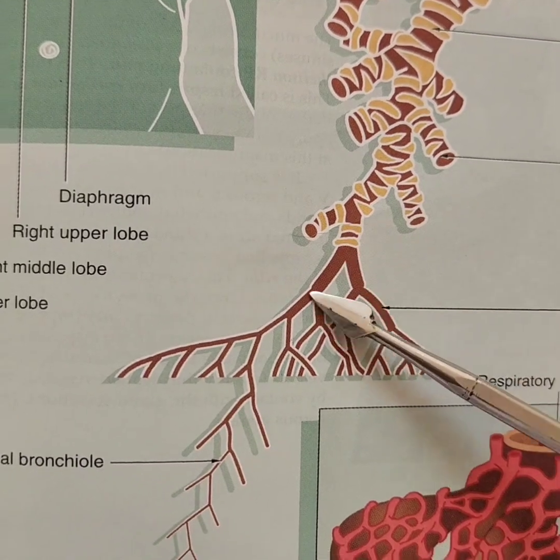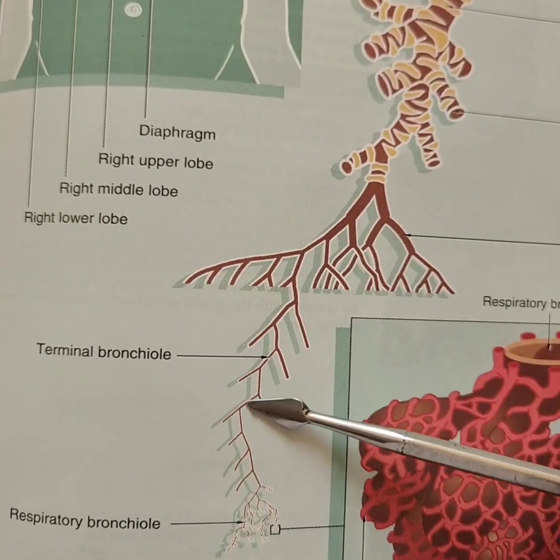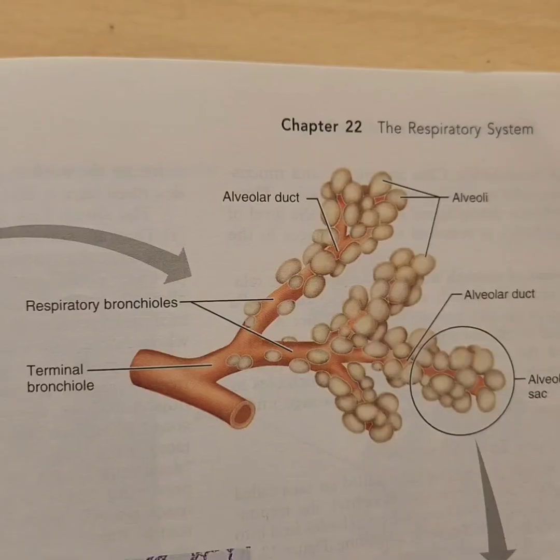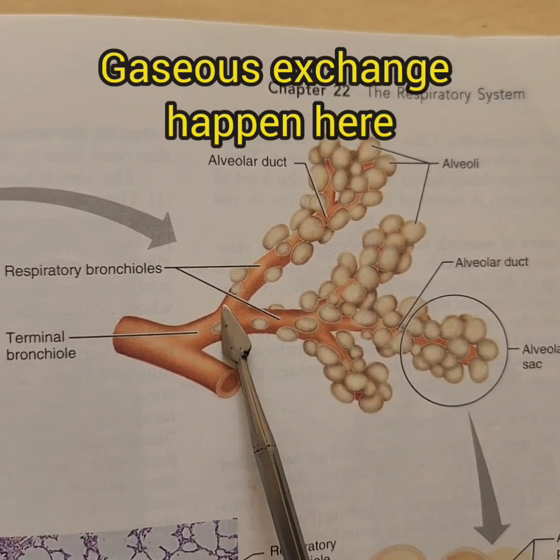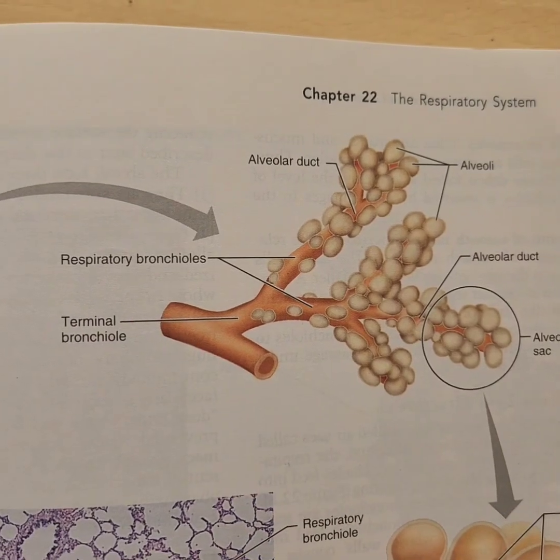Without cartilages and glands, the bronchiole divides in several hierarchies to form an anatomical conductive airway where it has some pocket-like openings. Here we see these are alveolar pockets which are opening on the bronchiole. This is a respiratory bronchiole. Just proximal to it, it is the terminal bronchiole.